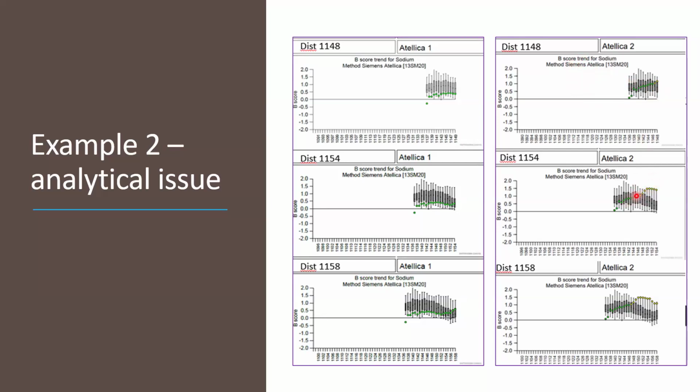So when this issue was identified, the main action that followed was that the operators of the instrument need to be reminded to perform the advanced clean before every chip change, and that replacement of the chip must not be approved in order before the clean is due.